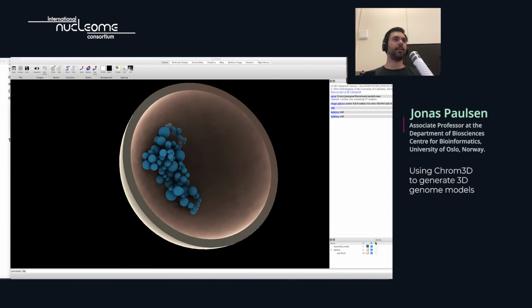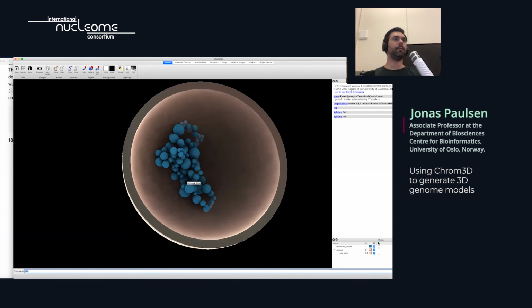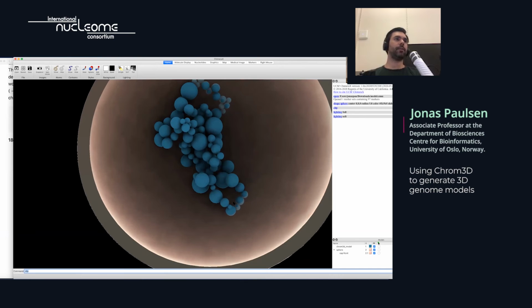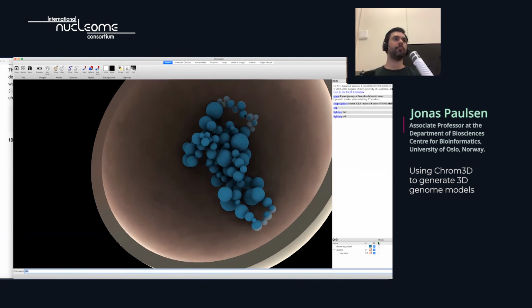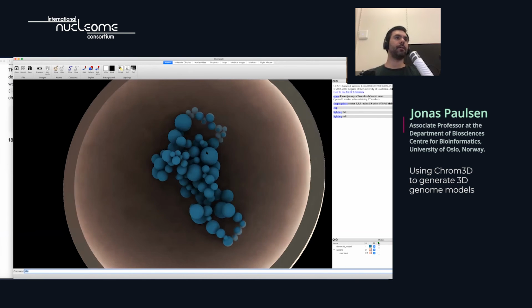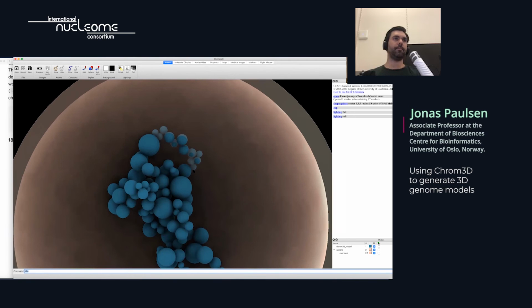To visualize that, we can go to step 19, which again, going back to where you ran this, copy the commands under step number 19. This unzips another script that we're going to need, which is called color beads.